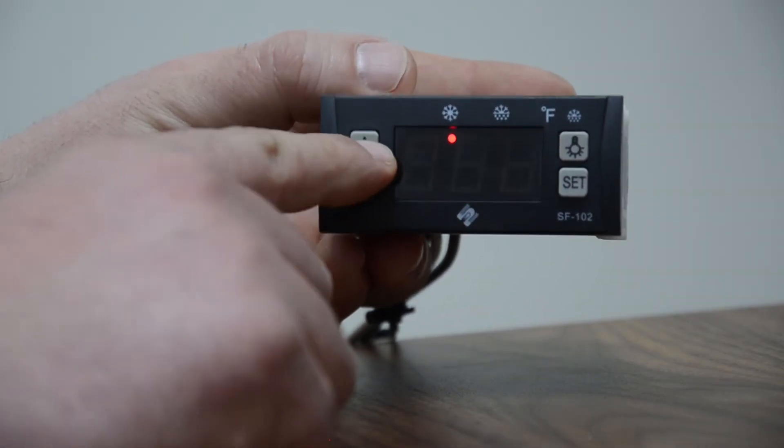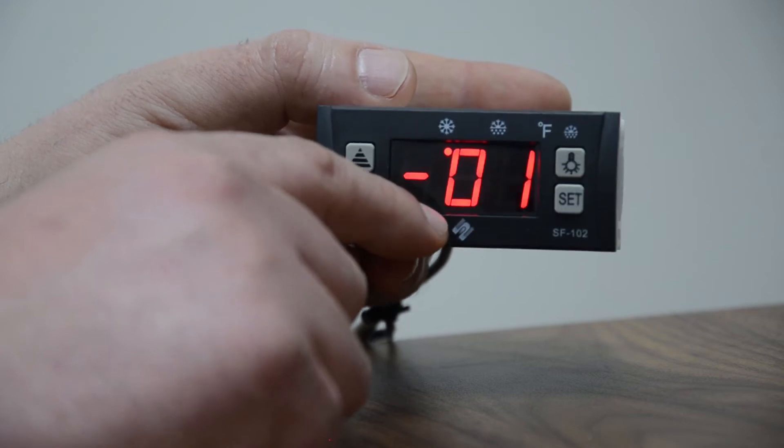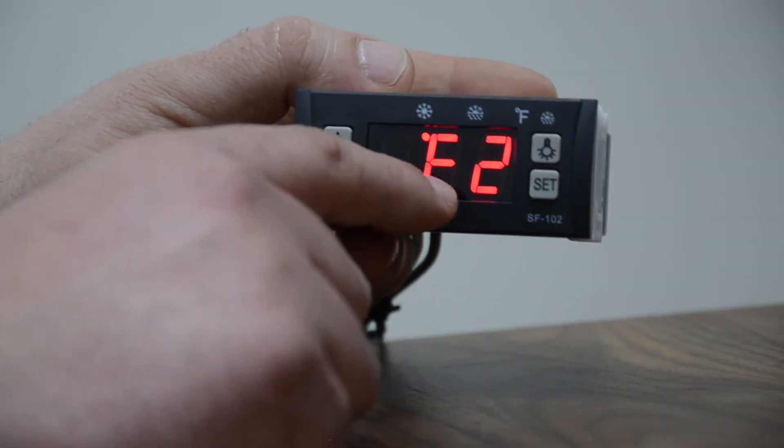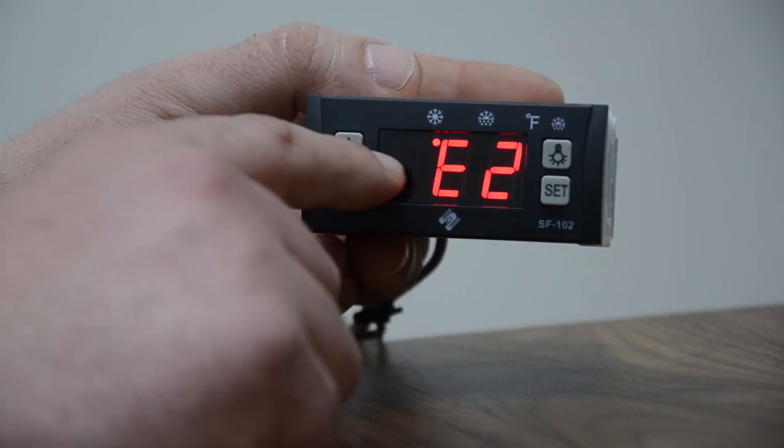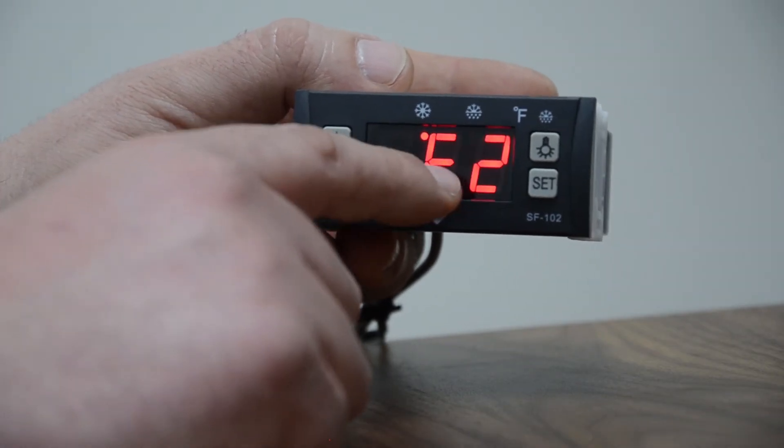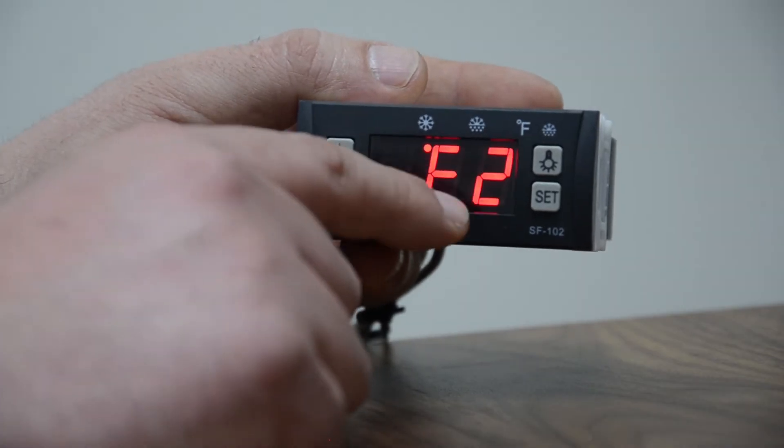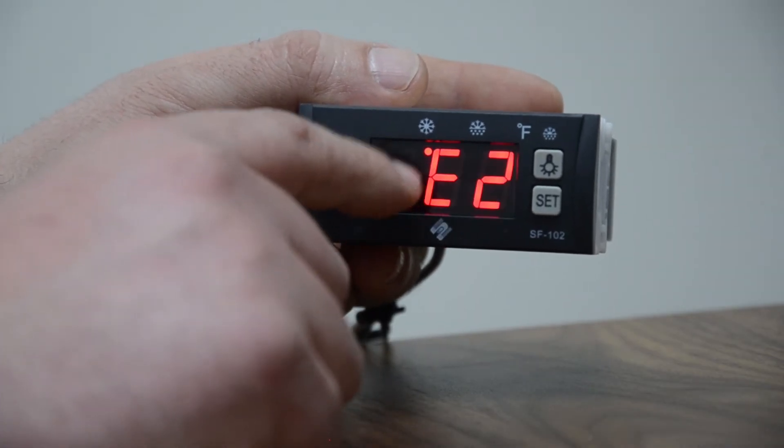If you increase it or decrease it for the lowest set point they want, depending on the products that are inside the fridge. E2 is the highest set point, the highest set point of what the fridge could reach for the customer that wants it, so it doesn't want it to go above eight degrees.